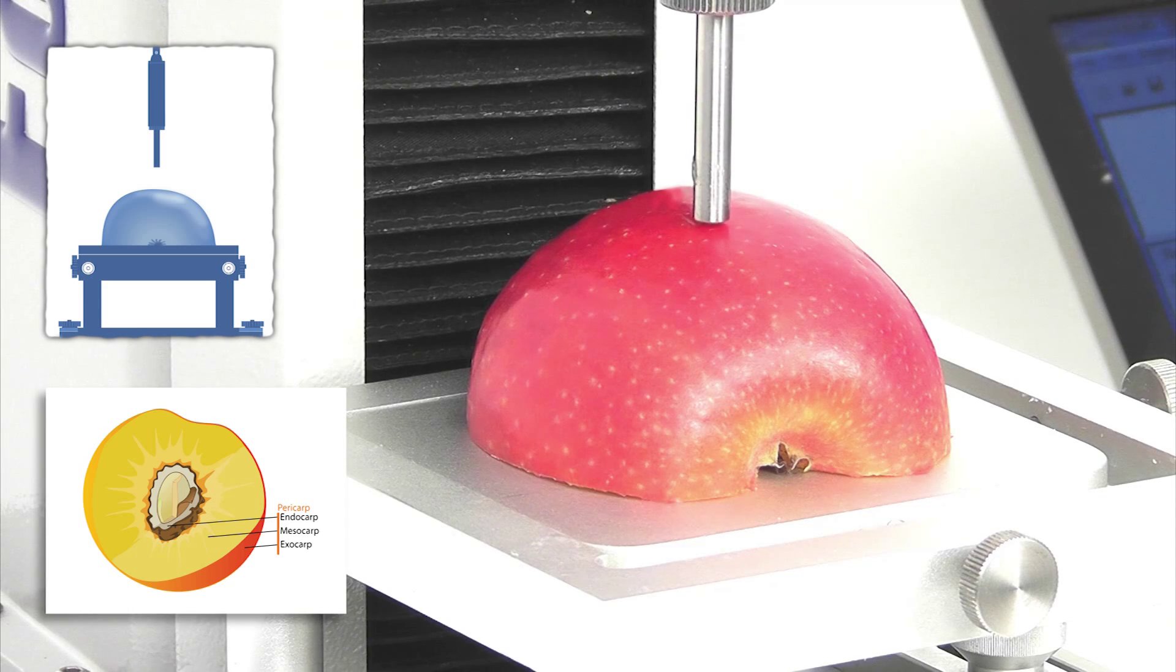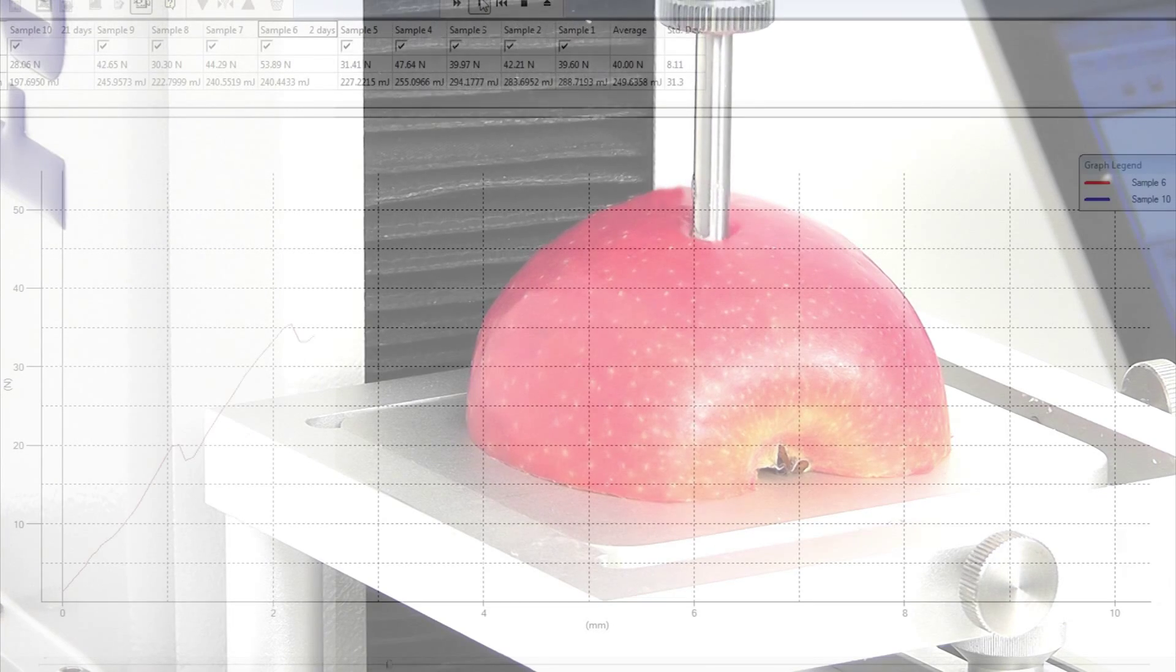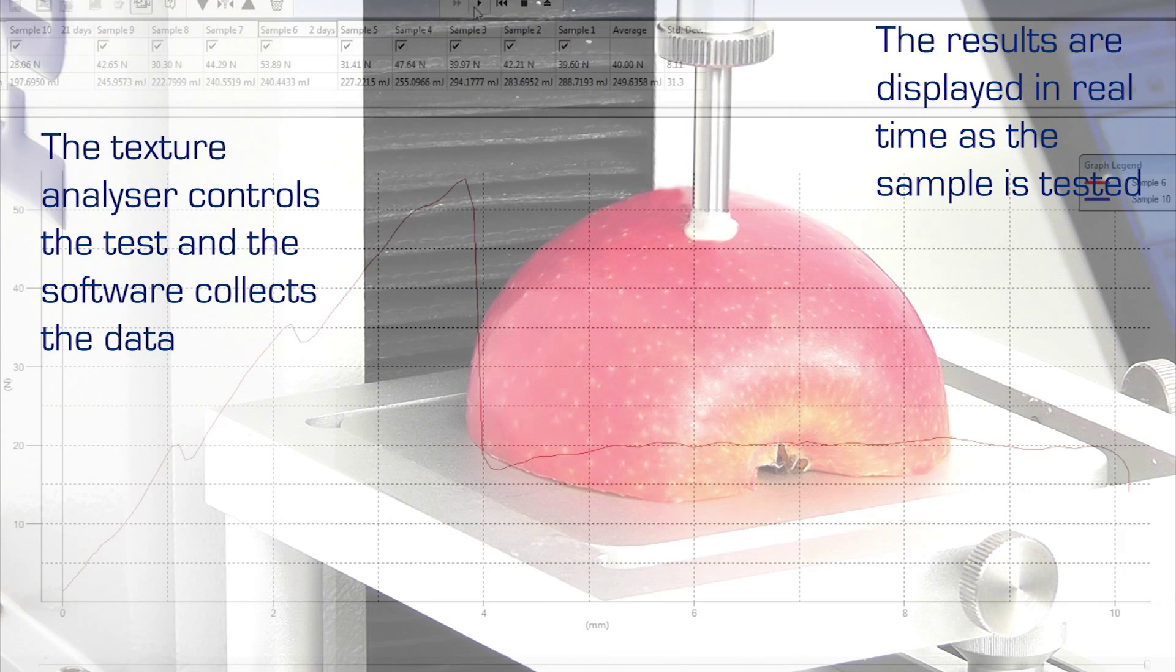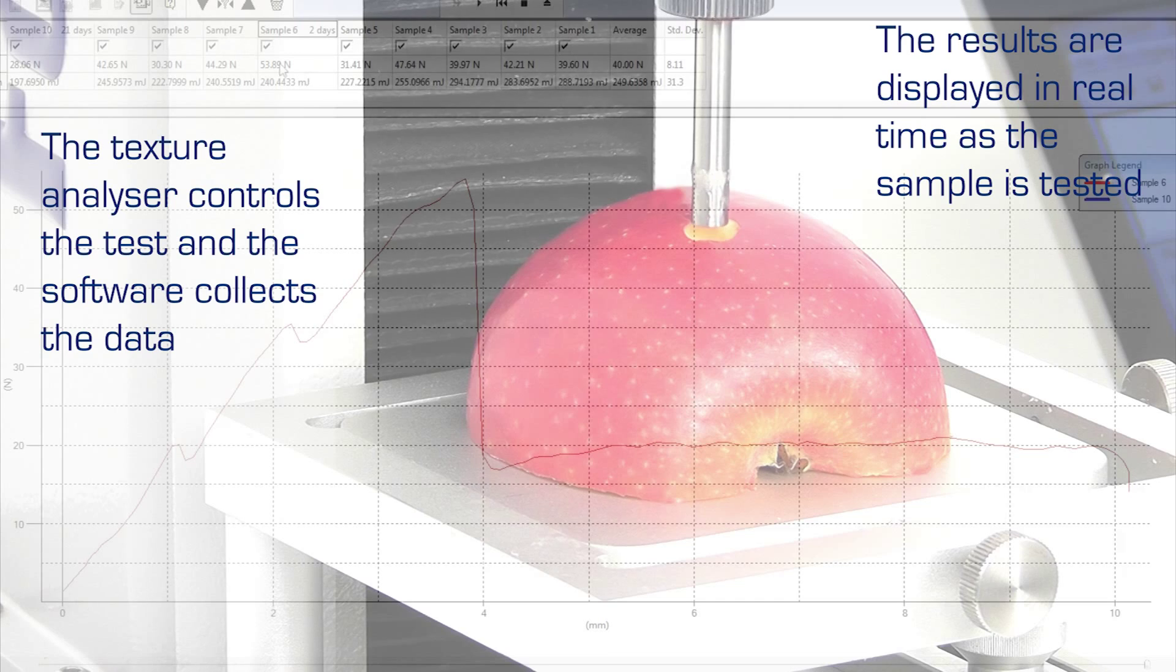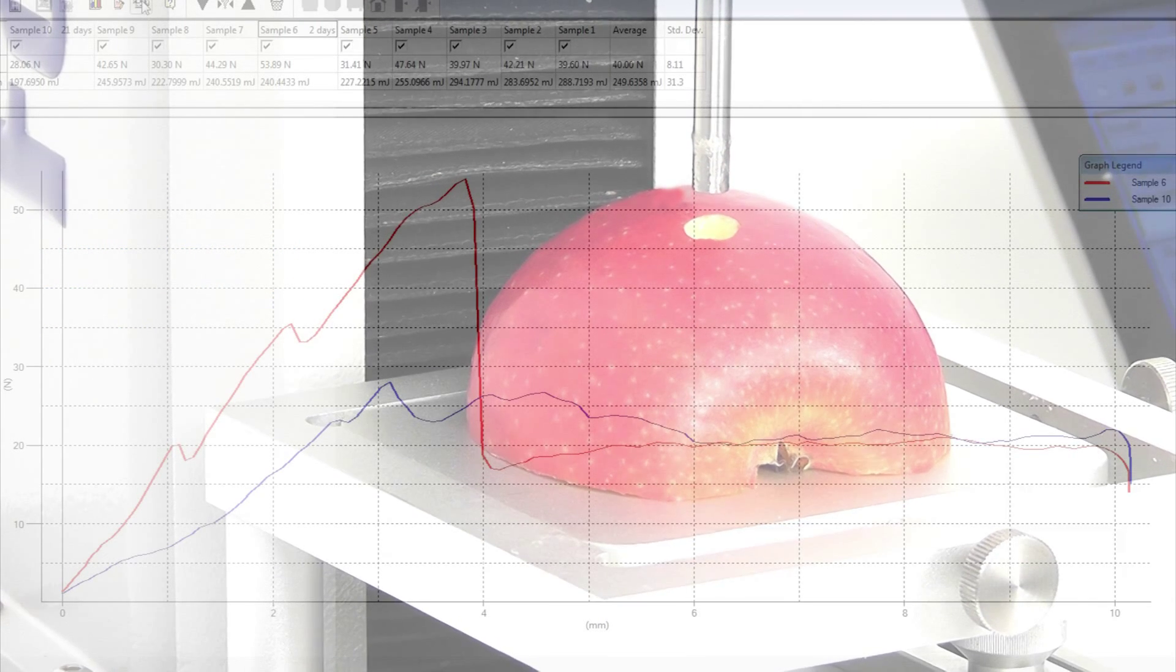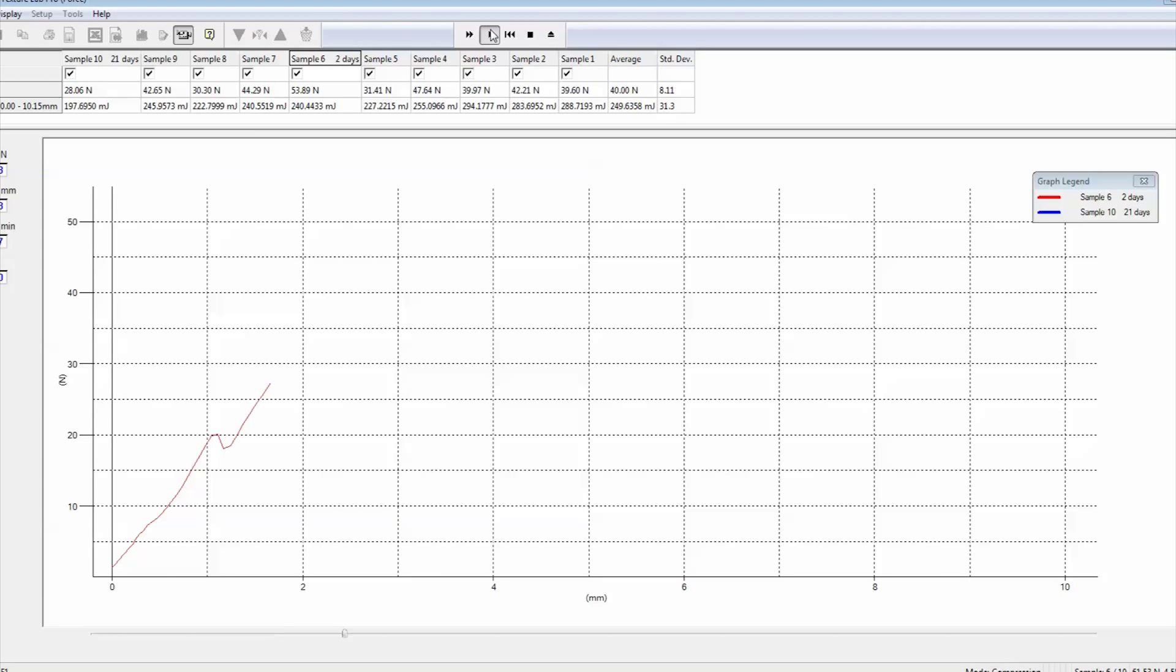Real-time graphing clearly shows the behavior of the sample under test. Features of the curve can be identified which indicate ideal or undesirable sensory characteristics and the calculated values correlated to preferred quality benchmarks.